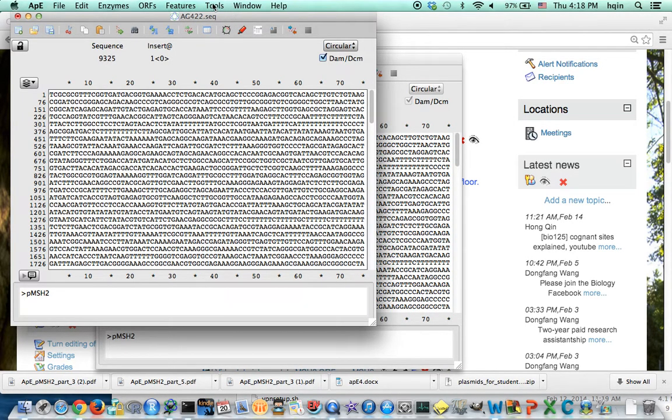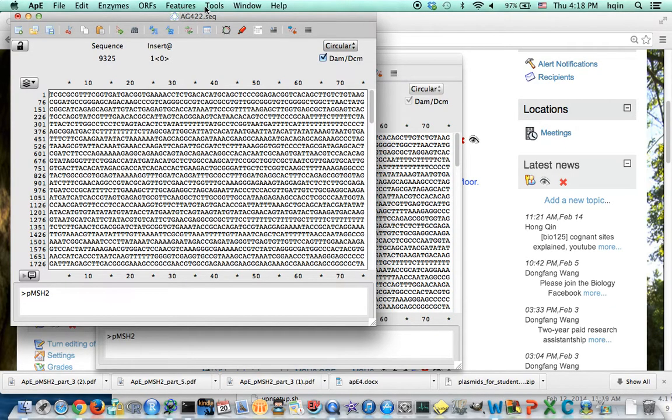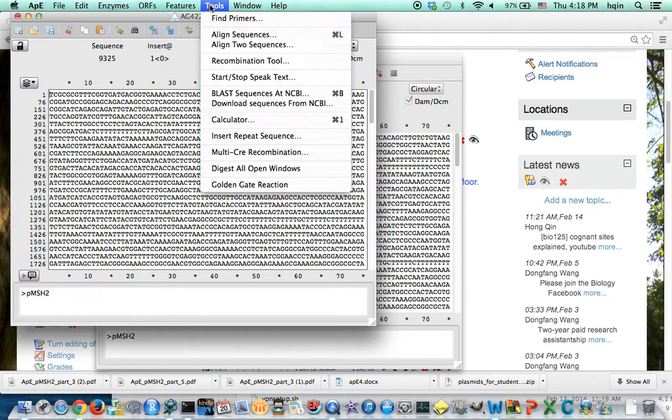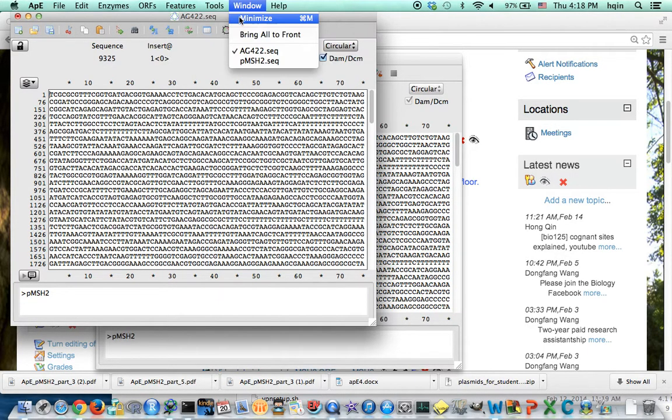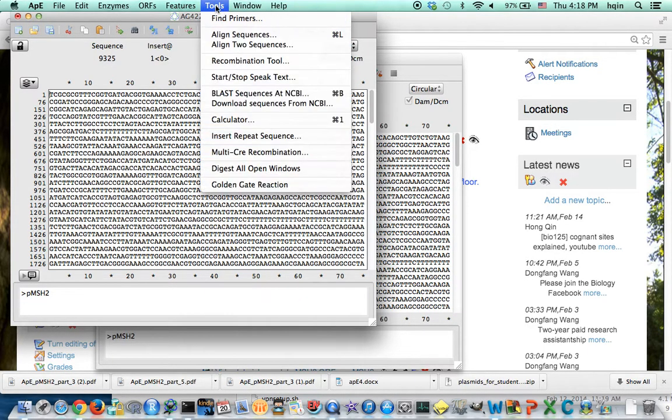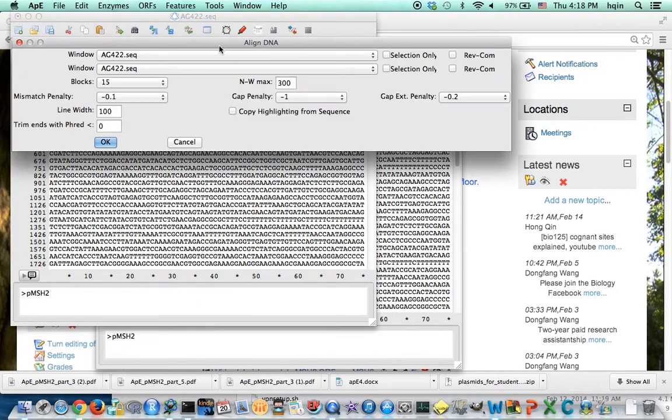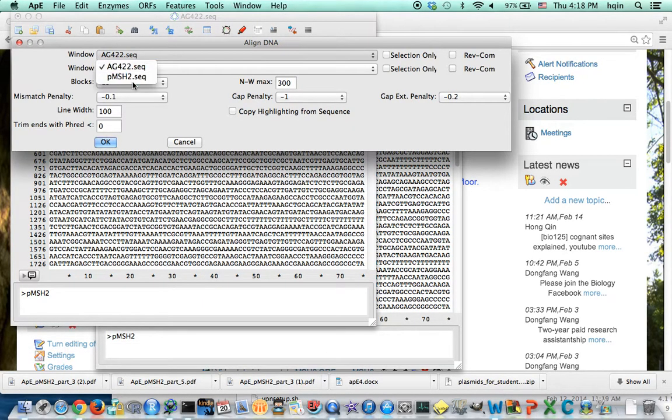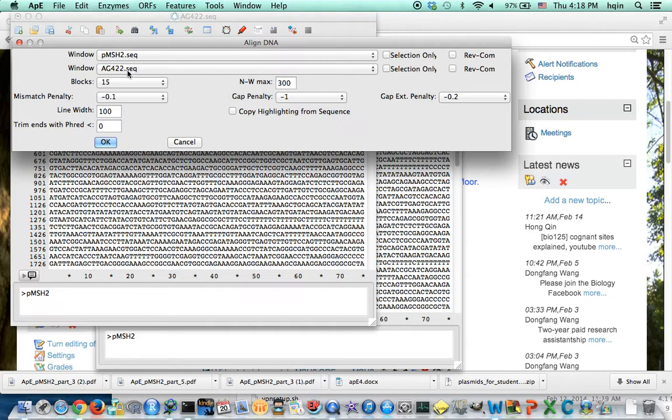We are using APE, a plasmid editor. Go to tools, align two sequences, so I'm going to put the wild type at the top, mutant at the bottom.